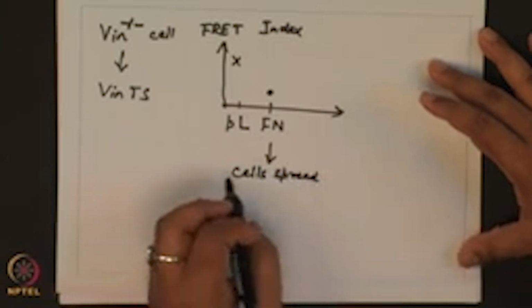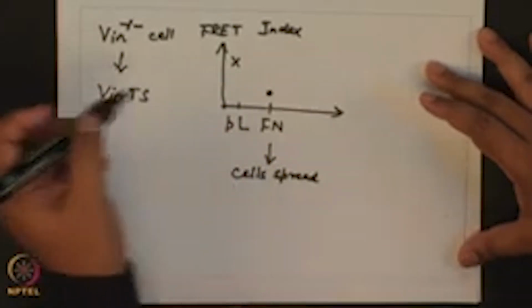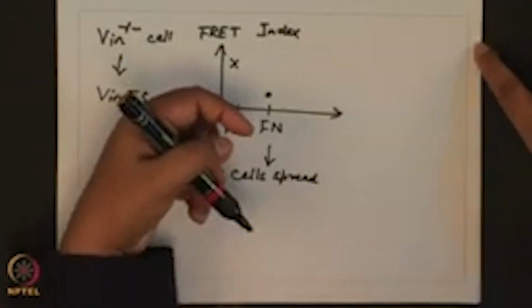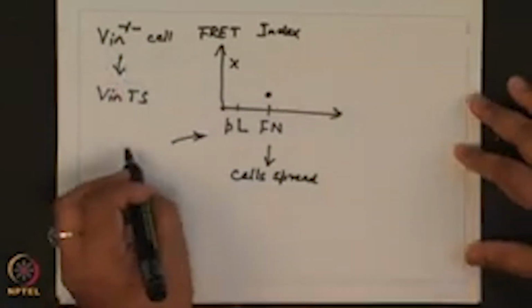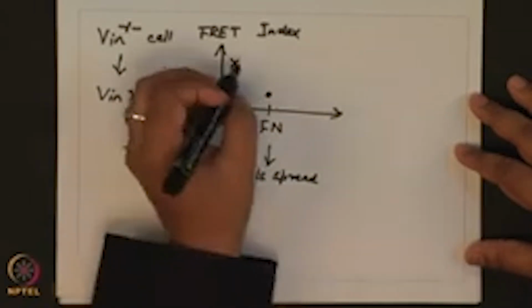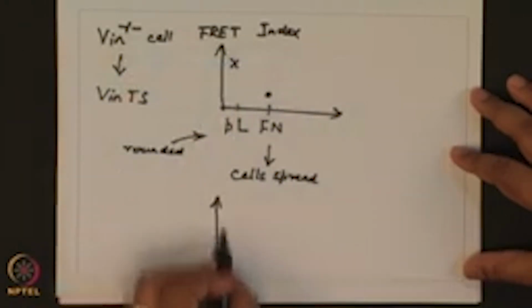So, these results suggest that fluorescence changes under force. Once the cells spread out, they will exert traction forces, and that should lead to a decrease in the FRET index. On polylysine surfaces, cells were much more rounded, and consistent with this the FRET index was much higher. You could also track the lifetime.